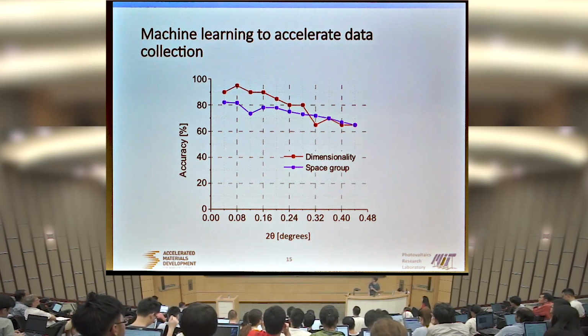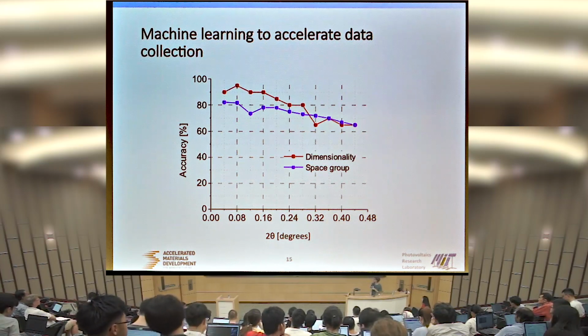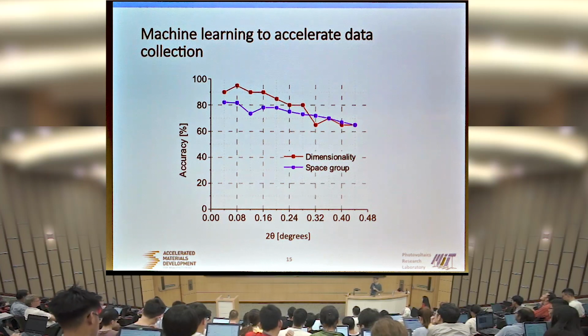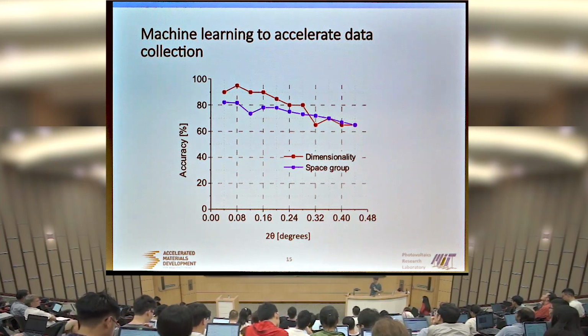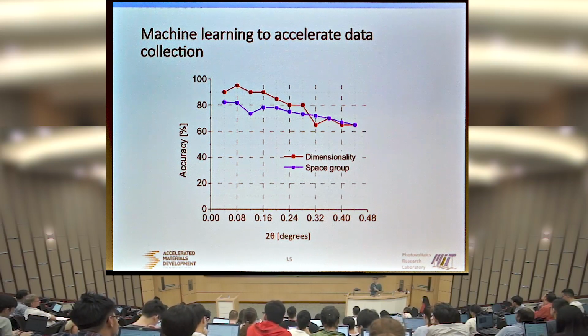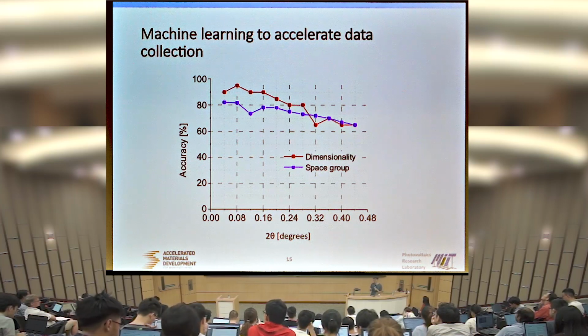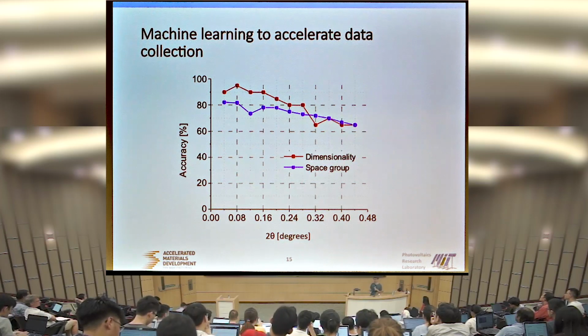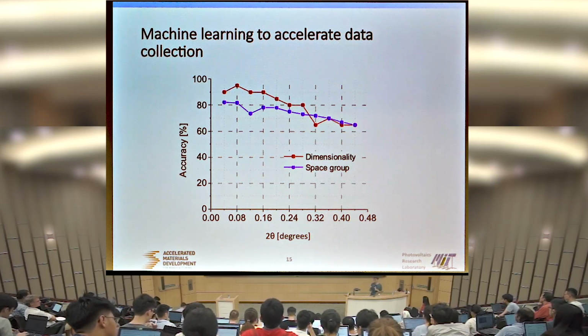So lastly, we actually did a completely different study. Well, it's not completely different. It's more like, now we take out the human elements, and then we use machines to classify those XRD spectra. What we were thinking is, in the measurement, we always take the measurement in a very fine step size, meaning we want to have our data free of noise. But if the machine can do the classification, how would the noise in your data affect the machine learning's output?